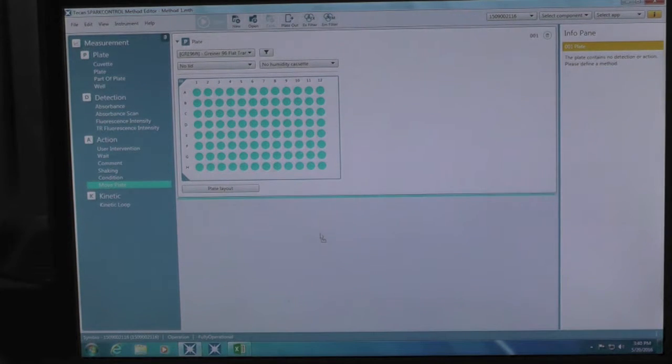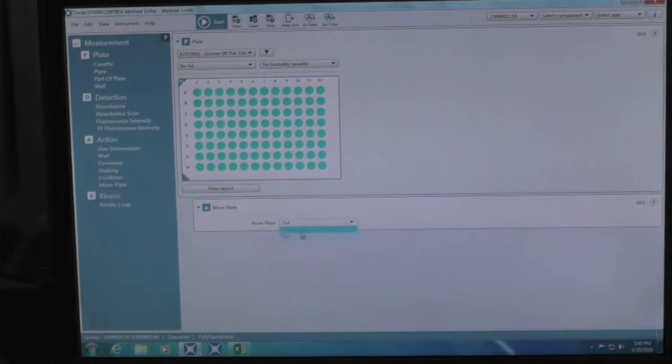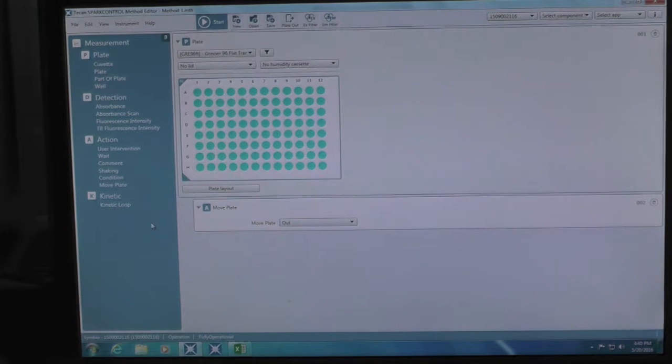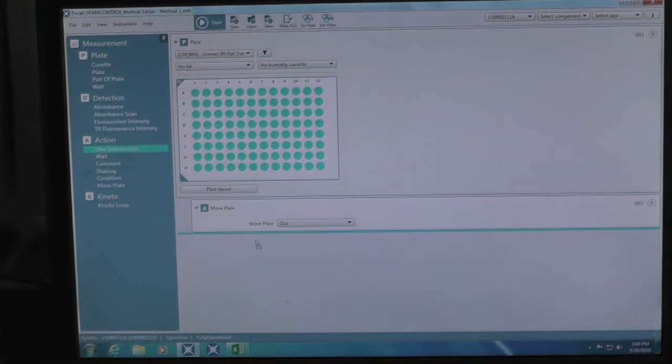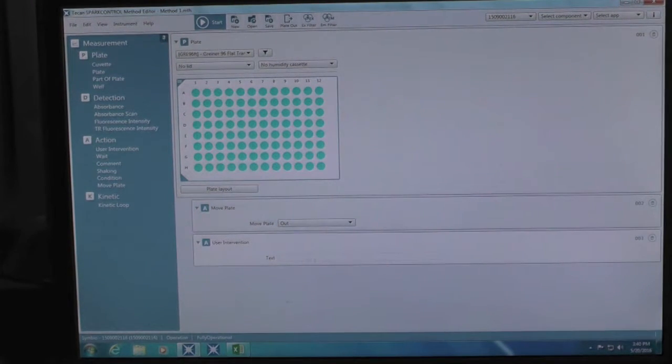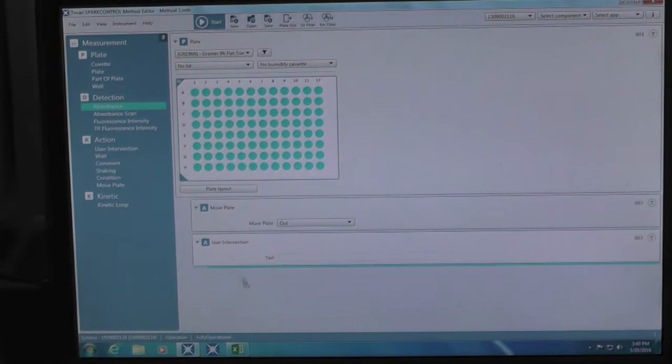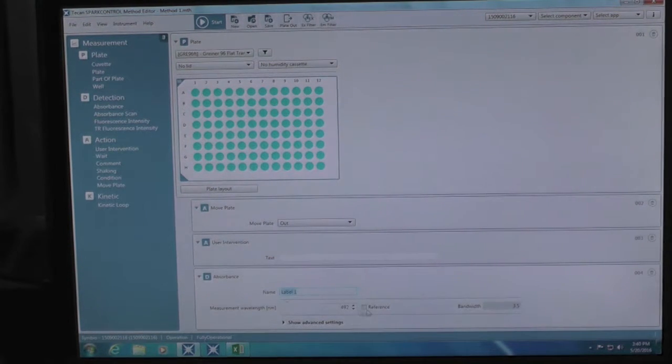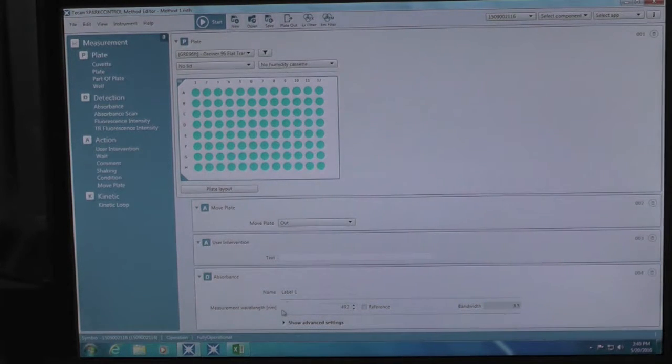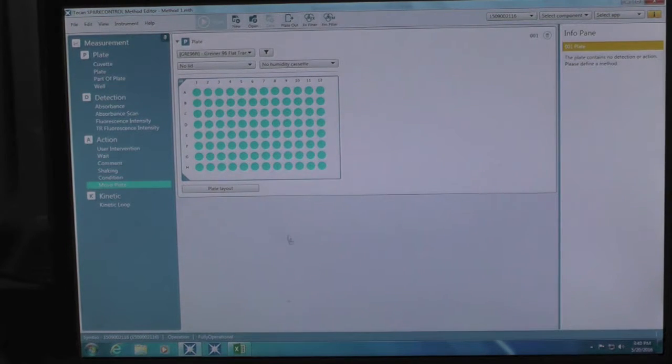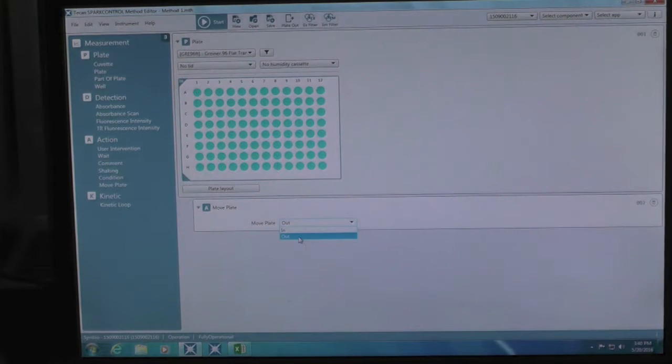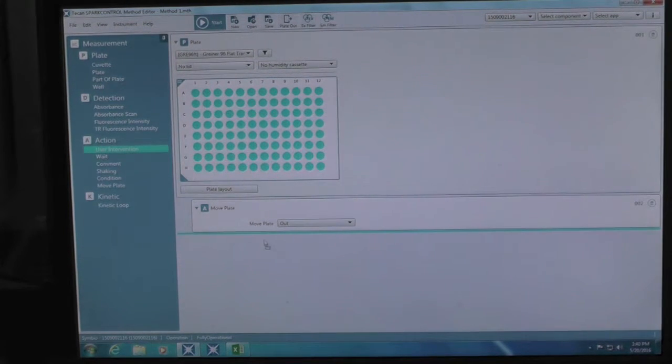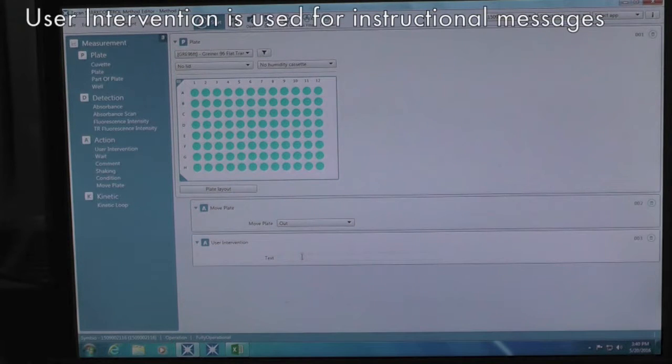Next, you can select different actions by dragging and dropping the selection to the program area from the left panel. If you want to set a detection method, drag and drop absorbance reading to the main program area. You can then set the particular wavelength of interest. If you want to set a moveplate function, drag and drop the item to form a logical sequence.